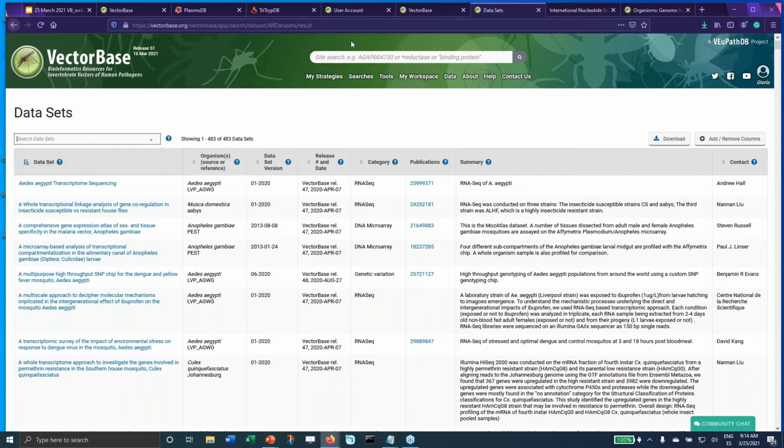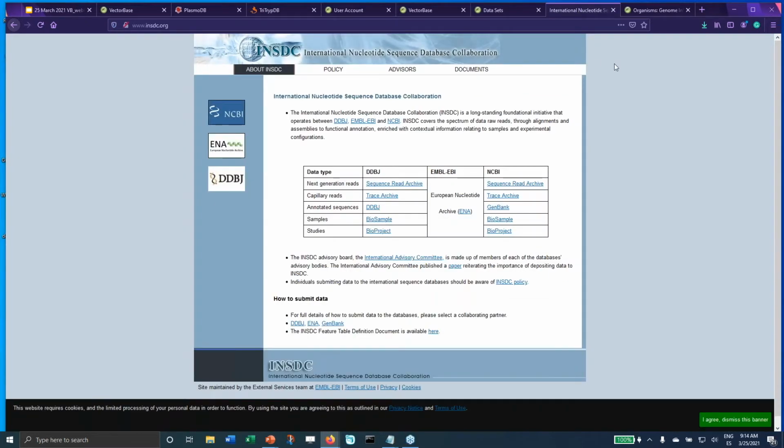Okay, so all these data sets are first deposited in one of the INSDC archival repositories, most likely NCBI or EMBL-EBI. And again, to reiterate what Marianne just told you, this is why when you notice some supercontig, scaffold, or chromosome name change, it's not something that we do.